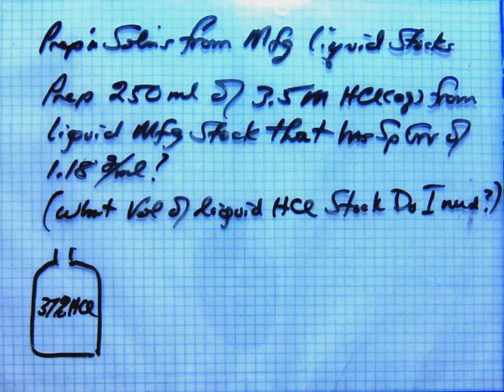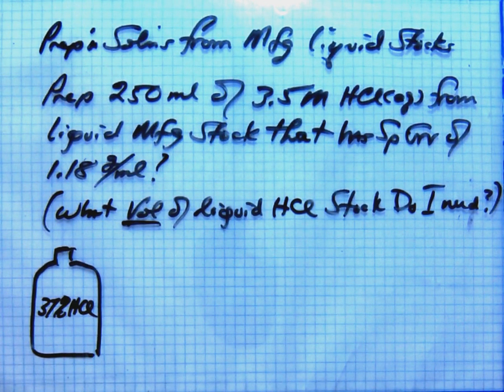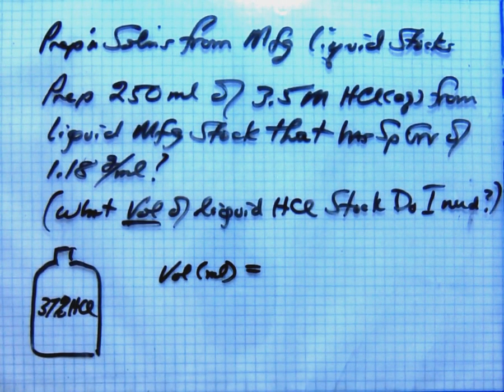So the question is, what volume? Well, if you look at the formula that I published on that little handout, it's the volume in milliliters that you'll need to extract, and you use a pipette to pull it out and transfer it into the water sample. Now, you always have to start by adding a strong acid into water. You never dump water on top of strong acid because it explodes. Remember A&W root beer? Have you ever heard of that before? Yeah, some of you have. Add acid into a small sample of water, at least twice the amount of acid volume, and then finish up to, but not to exceed, the volume. See the point?